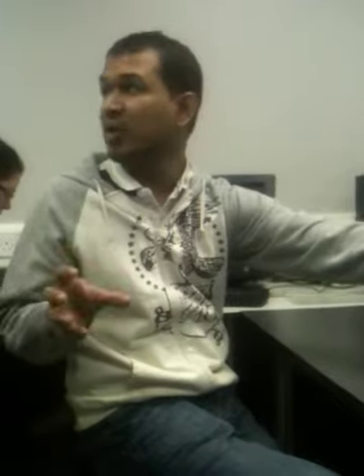Think about yourself. In the morning, like now, your eyes are fresh, your mind is fresh. Go down the line to Friday afternoon, your eyes are tired. So even in the same set of conditions, you're seeing the same fabric differently, right? Do you agree? Yeah. The same thing happens for a machine. The more you use it, the more it gets tired, even a computer needs to be refreshed. So if you want to get identical values all the time, we calibrate the machine with some standard.